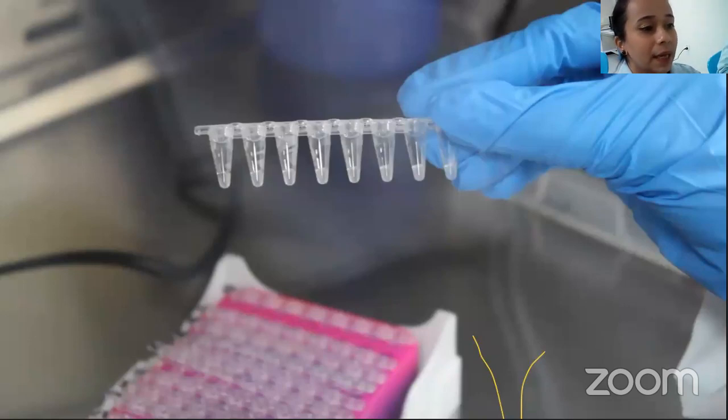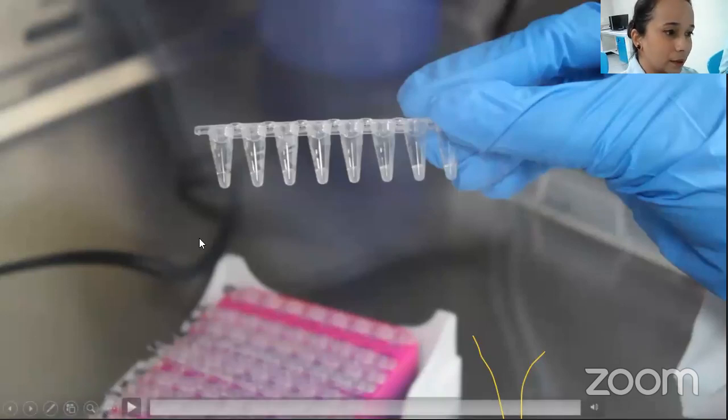If you see that any of the wells is not according to the other wells, you should have an idea that it should be 20 microliters. If it is not, then remake that well or the whole strip, which is more convenient. Okay.